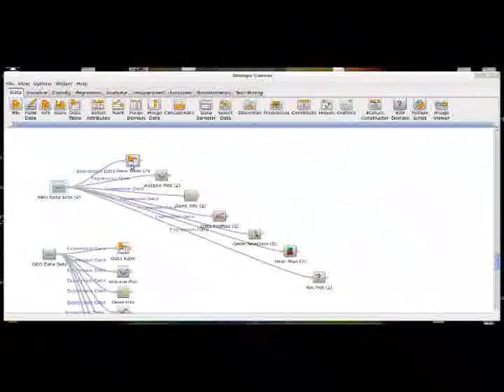So to give you an example of what this data looks like, here it is. So what we have is 9 samples from the expression level of 391 different genes of interest.